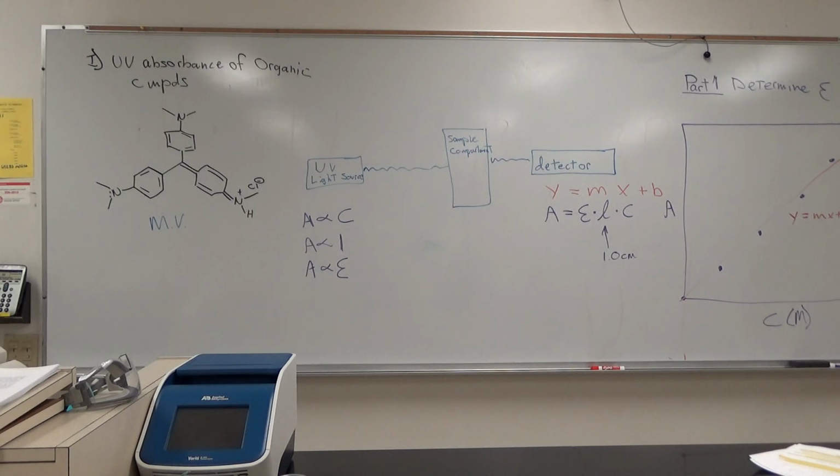So the slope is your epsilon. Let me just take a quick note. I think it's in the worksheet, but I can't remember 100%. Your epsilon should be in the thousands. That's how you're going to know you did it right. If your epsilon isn't in the thousands, if it's a small number, like in the single digits or less than 1, there's a mistake.